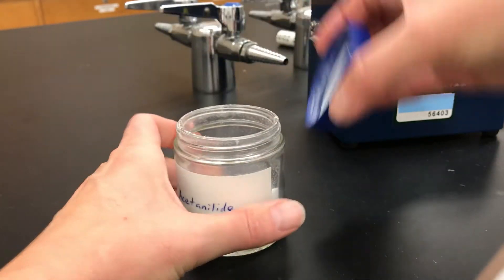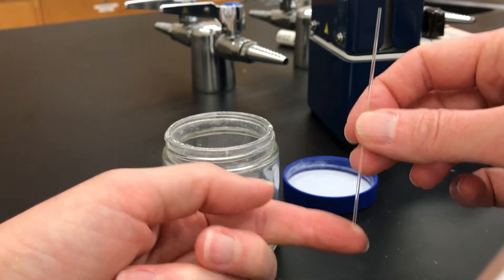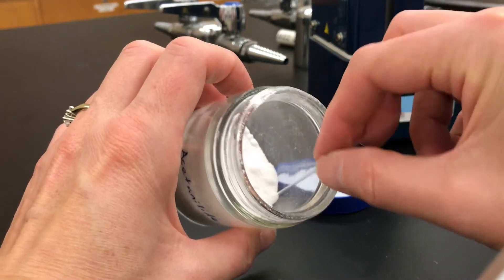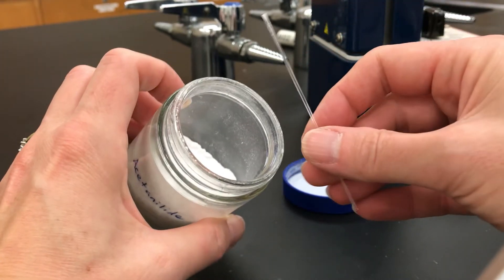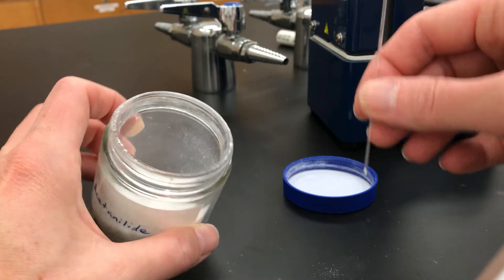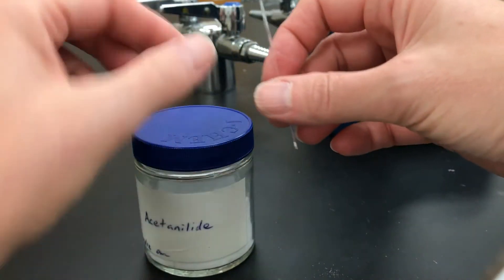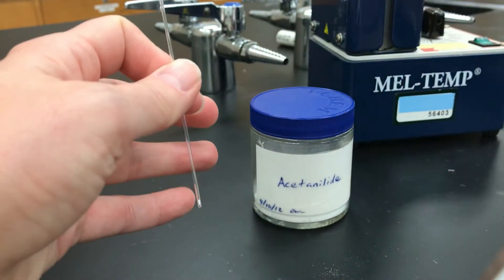First, take a capillary tube which is closed on one end on the bottom and open on the other end. Turn it upside down and jab the open end into the solid. If you jab it a few times you're going to get some solid to naturally go into the tube. Then turn it over and tap the closed end on the countertop to get the solid to fall down into the closed end — you want it to fill about two to three millimeters high. If there's too little, jab it in the solid and get more. If there's too much, get a new tube and start over.